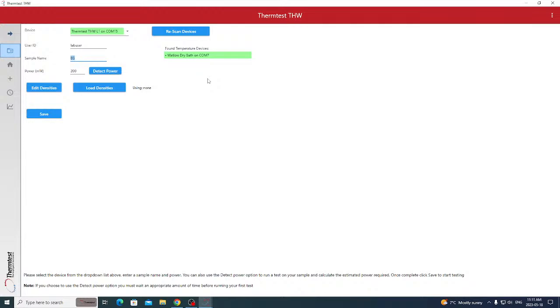In that sense, we are leading the industry on development of parameters using an intelligence approach. And that's really important, because although you can still do manual, we want to keep that spirit of measurement to allow you to do manual manipulation, both selection of parameters and looking at and analyzing data.